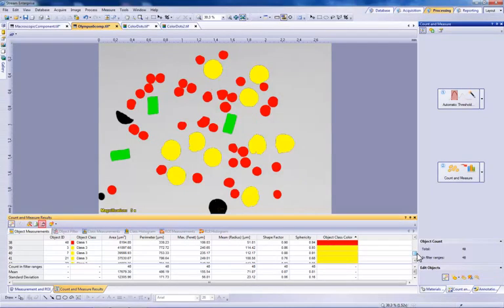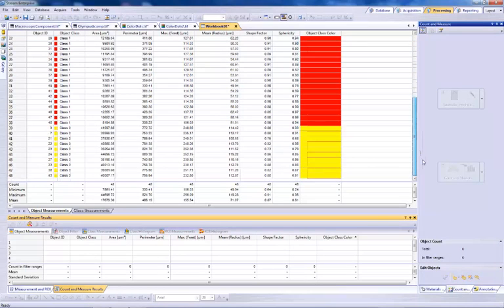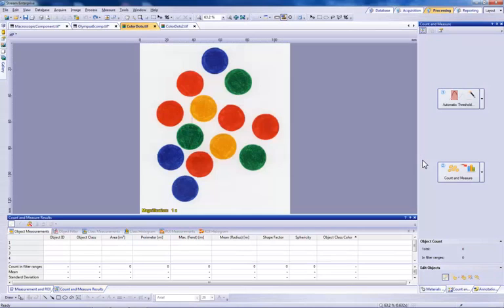We can simply create a workbook of all the object measurement results by selecting the Export to Workbook icon at the top of the tool window. This now places the entire list of objects with the applied class color sort we defined in our internal workbook. The workbook can then be exported to Excel or used to quickly save into our database or used in the Stream Report Generator.